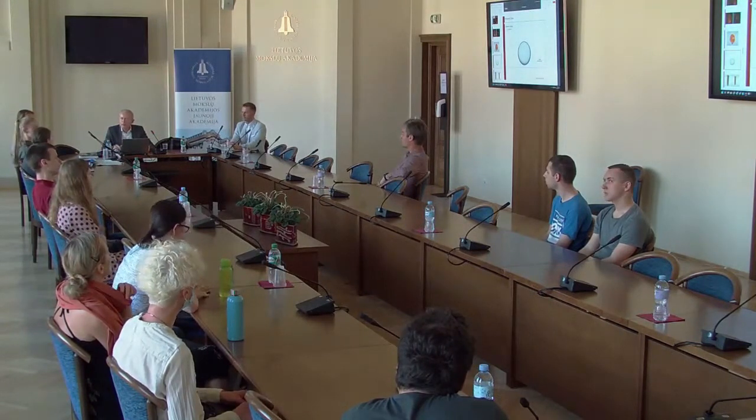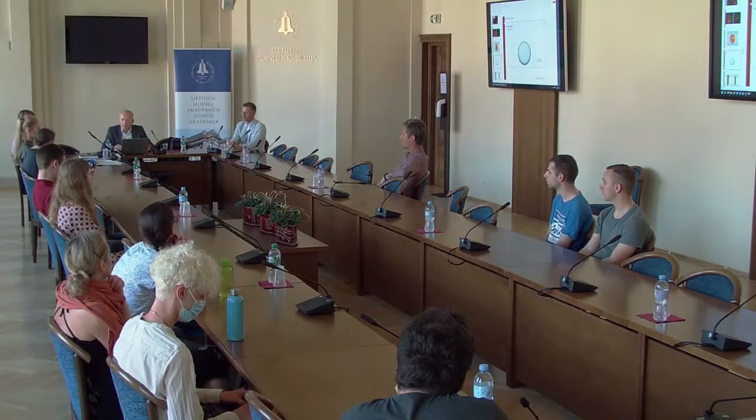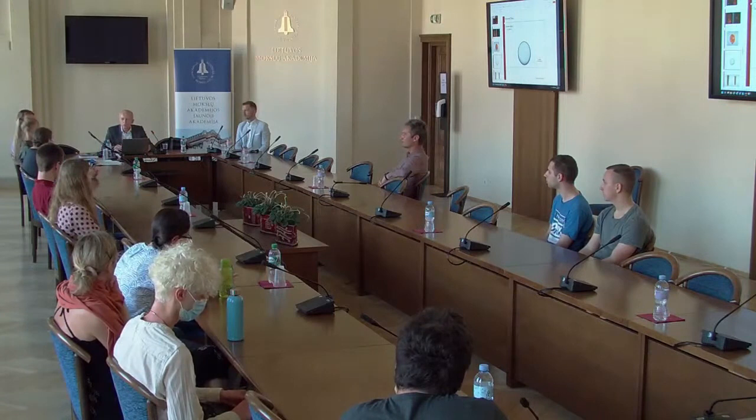Dantis labai geras pavyzdys. Jo, taip, būtent. Taip, jis labai kieta medžiaga, ji turi daug. Jo, taip, taip. Ir iš principo, sukalibravus prietaisą, galima pasakyti medžiagos tankį. Galima tiesiog numerius.